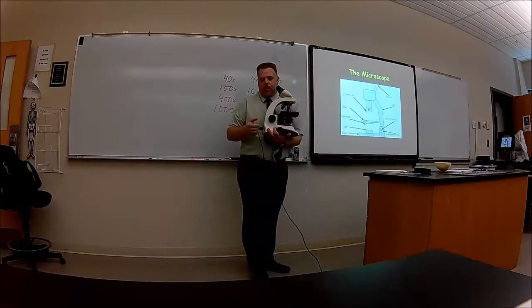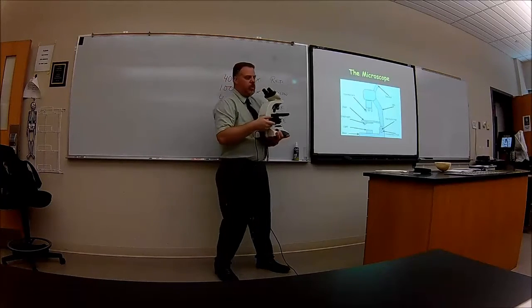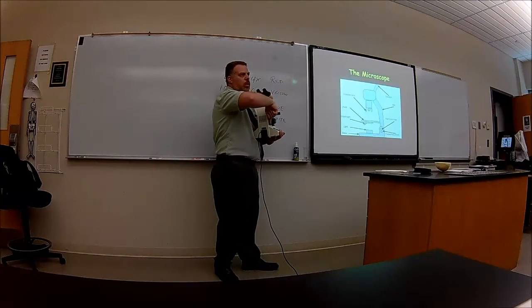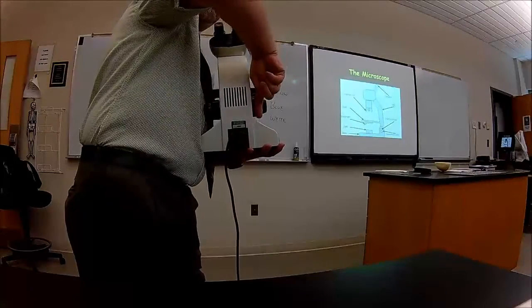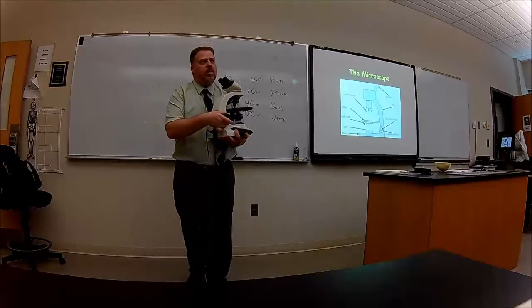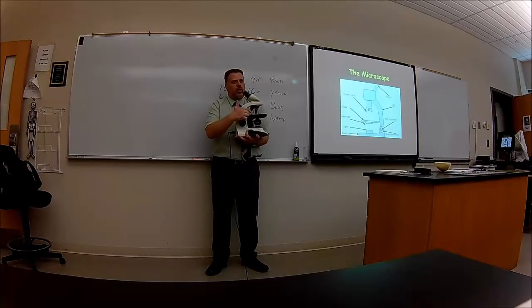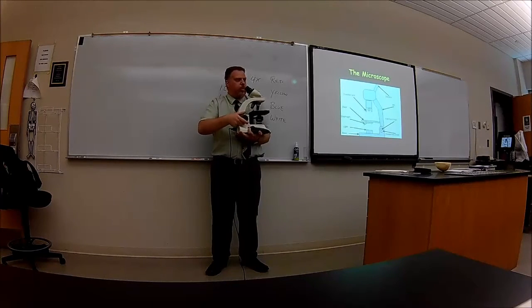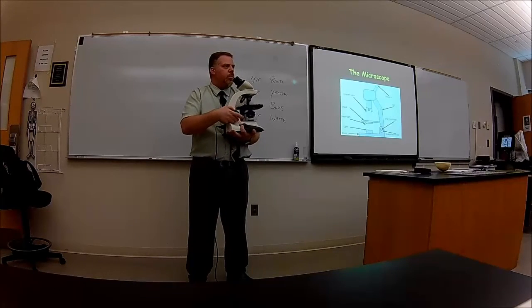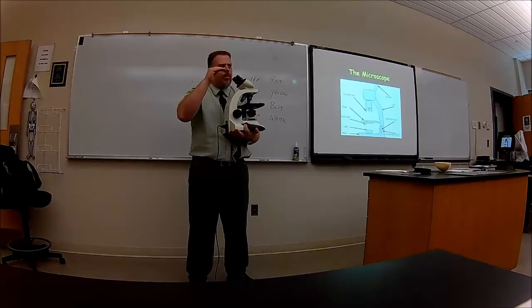A couple of other things on here. There are two knobs or dials — a big dial and a small dial within it. The big dial is the coarse tuning. When you move the coarse knob you should be able to see the stage move up and down quite drastically. Then when you move the smaller one, what we call the fine tuning, you don't see it really move much because it's very fine. It is going up and down, but it's very minute.